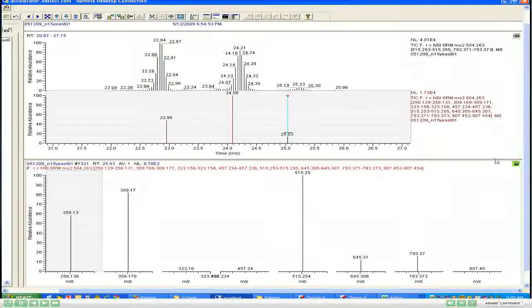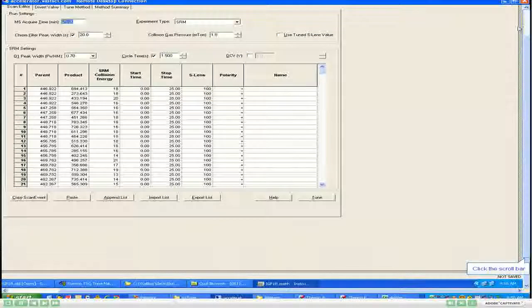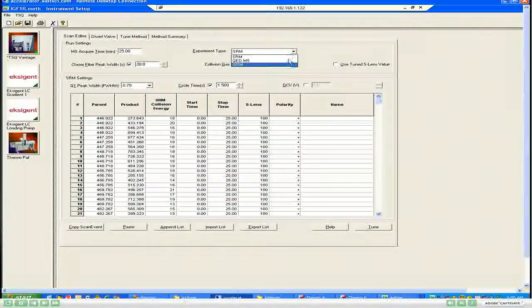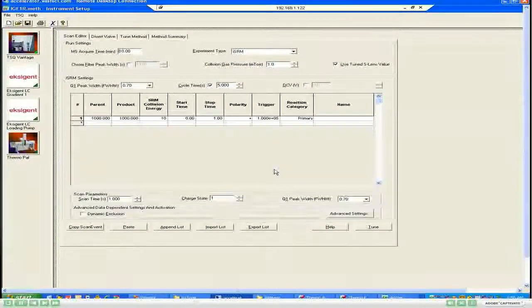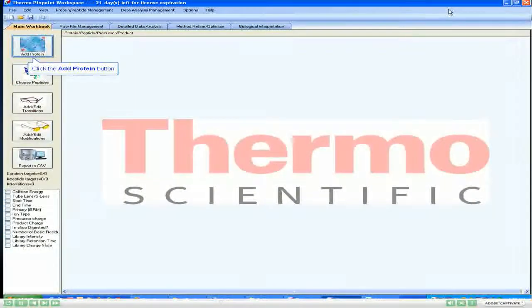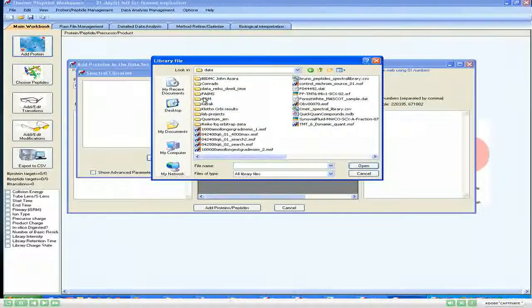Let's go in here, and so at 22.95, this is how the secondary scan looks. So we got all our 8 transitions for 504 precursor at 22.95, whereas we needed only 2 to be monitored for the entire gradient. So we can optimize the utilization of our dwell time and still get all of the 8 transitions. And at 24.08, where again both the primaries went above the threshold, we again triggered our secondary scan and we got all our 8 transitions.